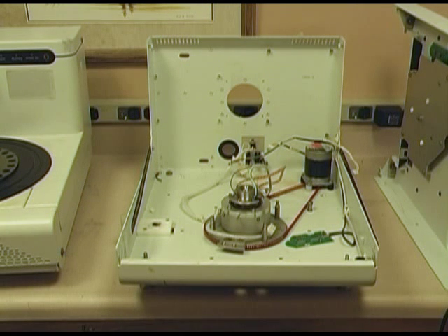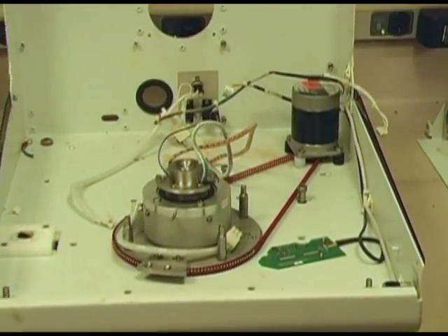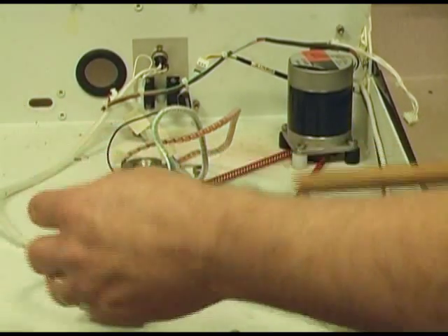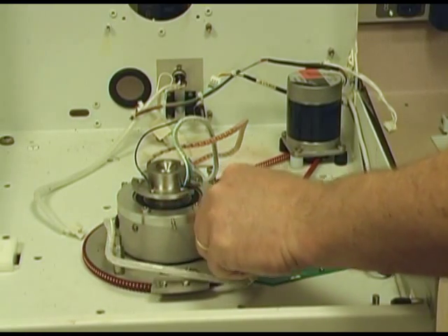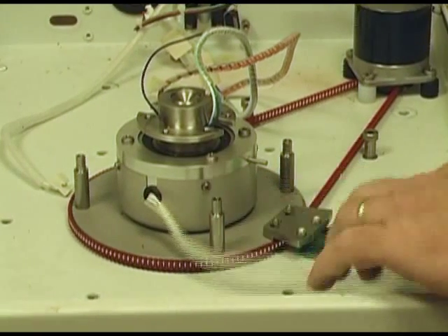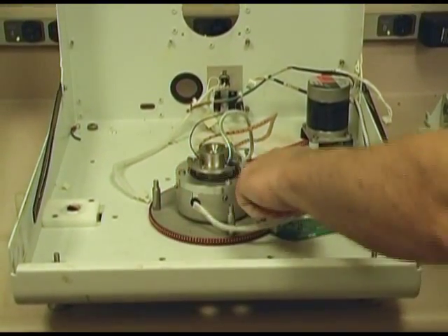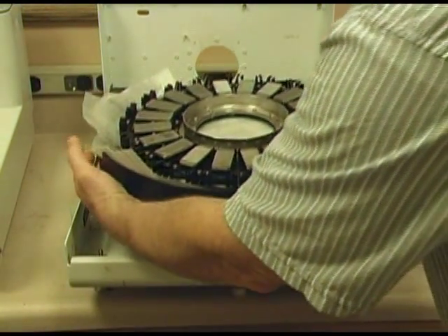Let's take a more in-depth look at the slide staining module. I've taken the assembly apart. What you see here is the motor that drives your slide carousel around. You see down here some magnets — two of them. When they go over, they hit a switch to this detector, and that's what tells the unit what position the slides are in, one through 24.